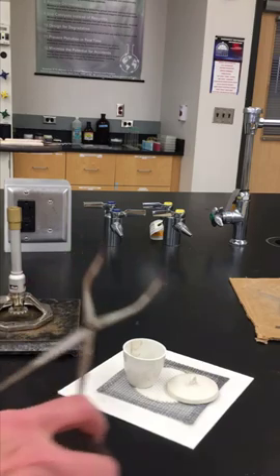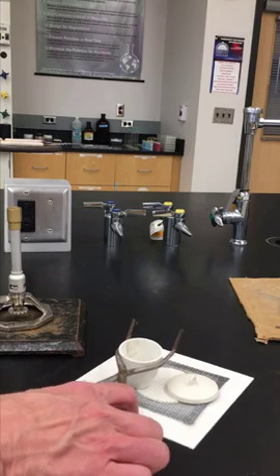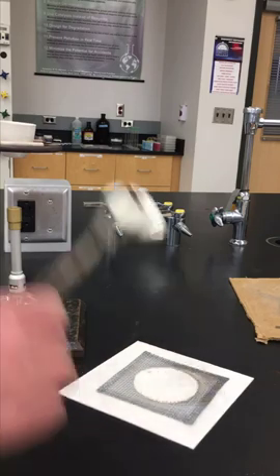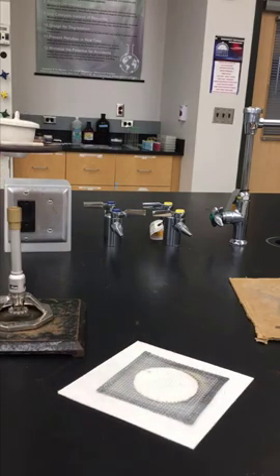And put it up here with the lid. Please ask any questions you have in class so that you do this experiment properly. It's a fun experiment. It's a great observation. It's a cool reaction.